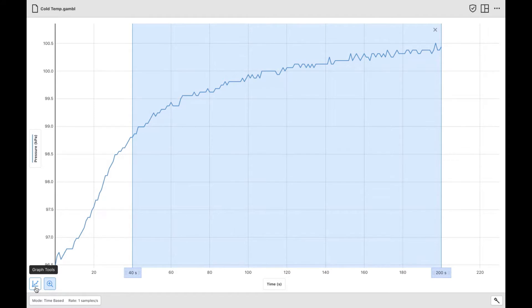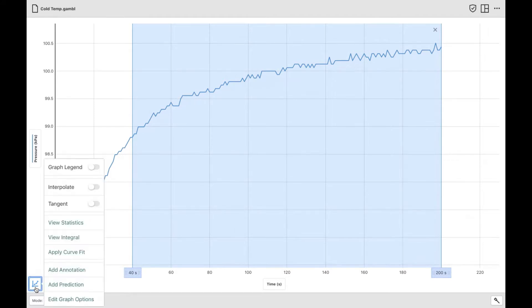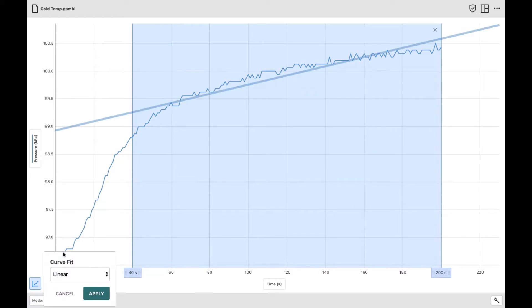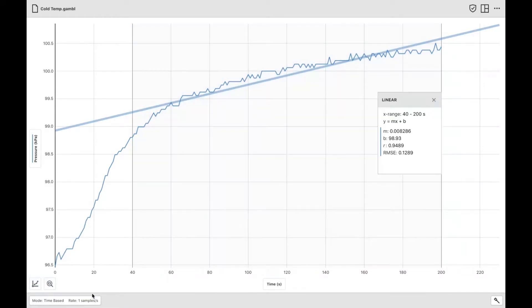I'm going to go to the corner to graph tools, click apply curve fit, and it's going to default to linear. I'll hit apply and you will see that the data shows up on the right-hand side. What we are looking for is the m value — just like on the baseline — m is the slope. We're going to compare the slope of this cold temperature H₂O₂ to the room temperature or control H₂O₂.